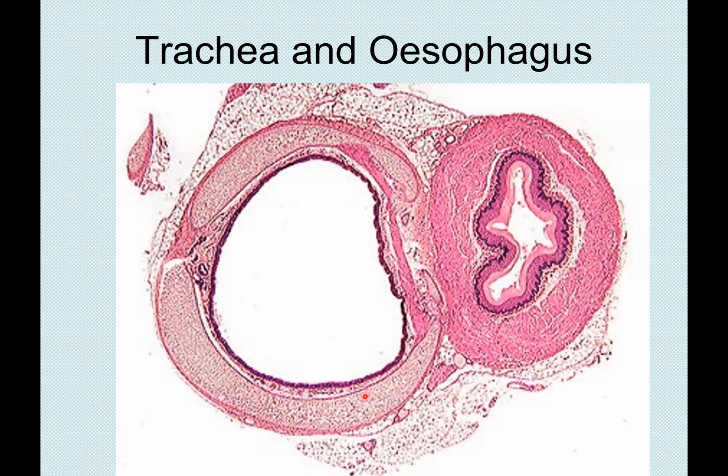Okay. Then what is this? So the pointer is not moving. Are you sure? Or is it only your screen? Can you see? The network. Yes, Stella. Muscularis mucosa. Oh, this place, that's no muscularis mucosa. Look at it again.